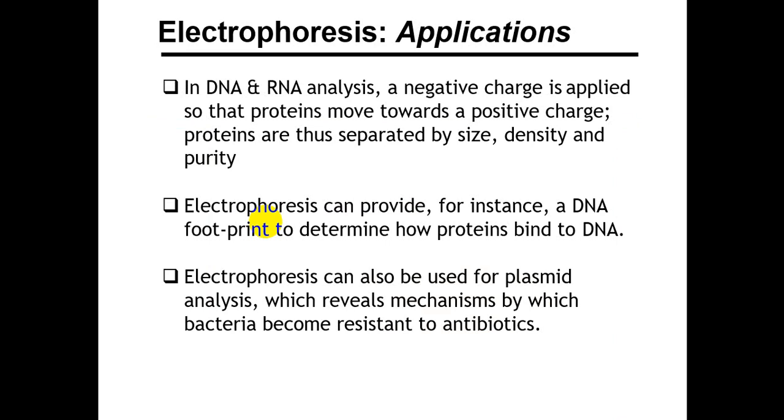So what are the applications of electrophoresis? In DNA and RNA analysis, a negative charge is applied so that proteins move towards a positive charge. Proteins are thus separated by size, density, and purity. Electrophoresis can provide, for instance, a DNA footprint to determine how proteins bind to DNA.